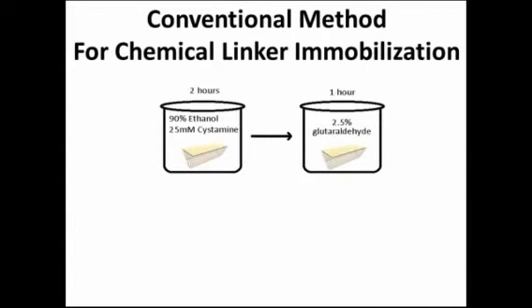In my lab, we have investigated various immobilization methods because we are working in a complex environment. We chose extravidin as a direct chemical linker to the capture probe in order to take advantage of its strong binding affinity to biotinylated probes, as well as its superior anti-fouling properties against human serum proteins.